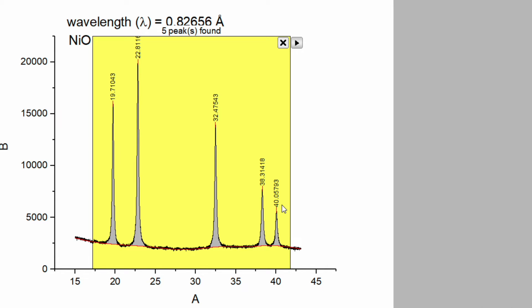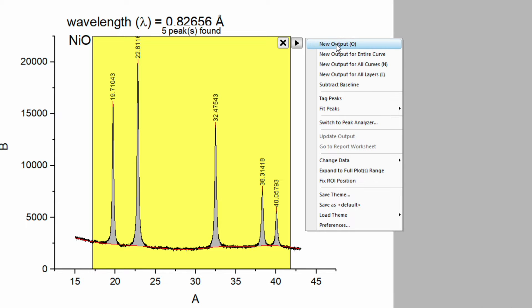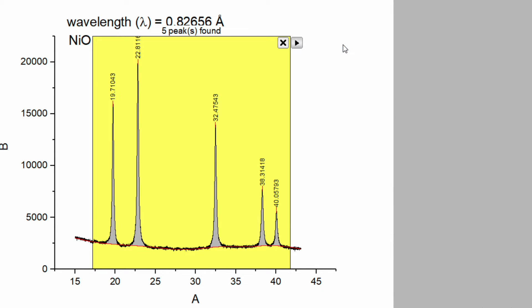So now we can see we got the peak center for all five peaks. Click on this arrow and go to the new output. Just click over here.